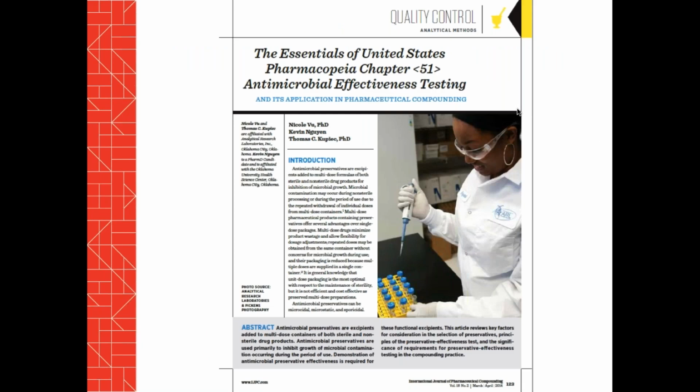This is an article that has been included that was authored by Dr. Vu and some students. It's a good article on antimicrobial effectiveness testing, and I believe Amy has provided those for a resource. And at the back of each of those articles are a lot of references that go back to the source documents.